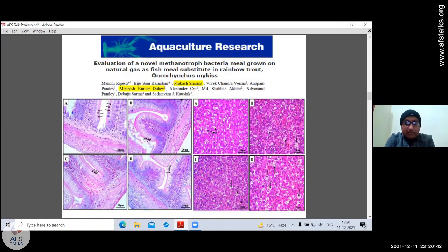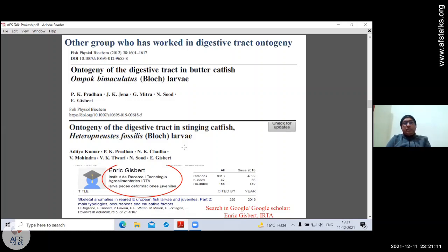digestion ability, luminal protein digestion, was decreasing, and what is called the intracellular digestion was increasing, corresponding to the decrease in the protein digestive enzyme activity in the intestine. And then similarly, the lipid in the hepatocyte was increasing in response to the bacterial meal. So these were the biomarkers we could develop over a period of 6-7 years, which we can use in other subsequent studies coming in the future.